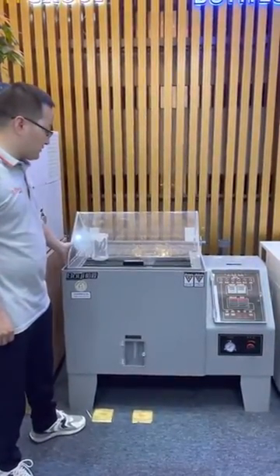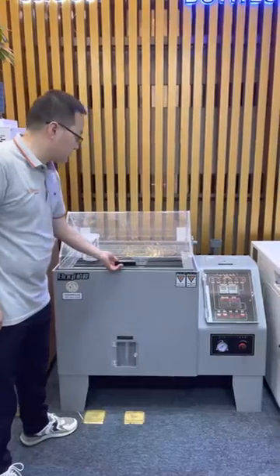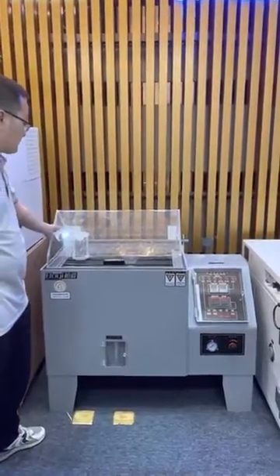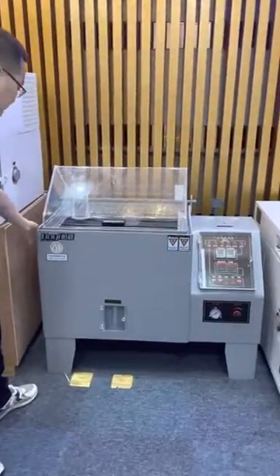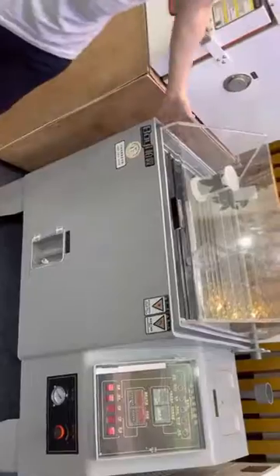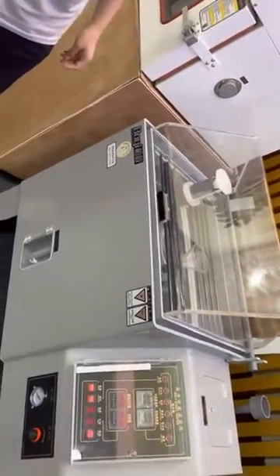This is our salt spray housing test chamber. First, you can see the material is plastic. It is a corrosion resistant plastic material.